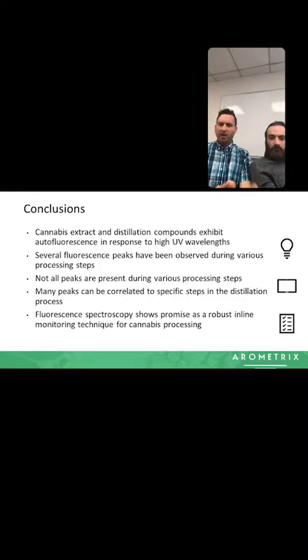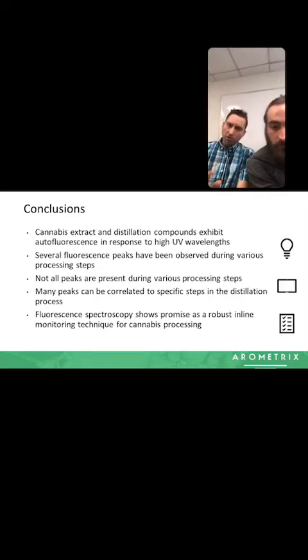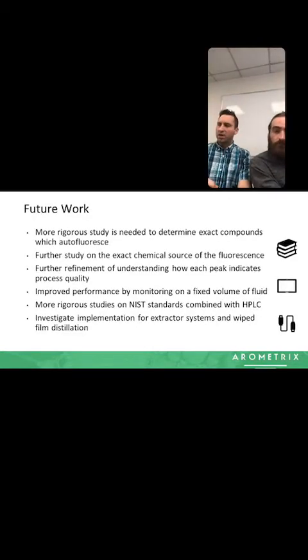And finally, just to sum it up, fluorescence is looking like a very powerful technique, more powerful than a lot of other suggested techniques for inline monitoring and quality control in distillation and extract. But we have a lot of work to do. We're not done yet. We're pushing forward, advancing the technology, maturing the technology.